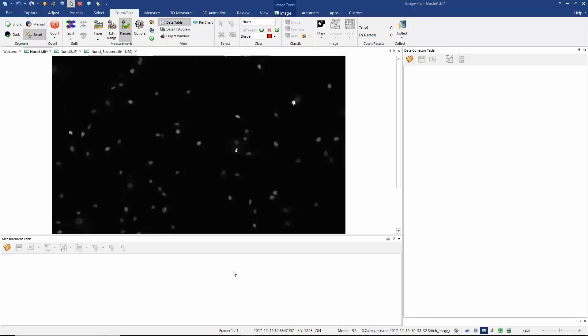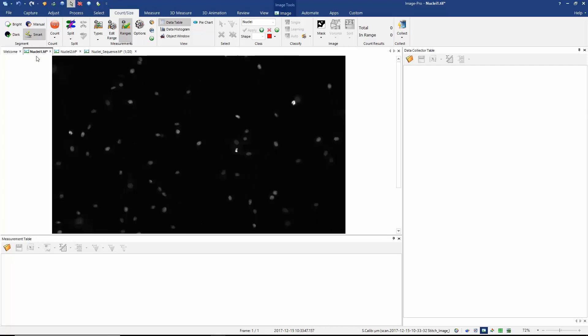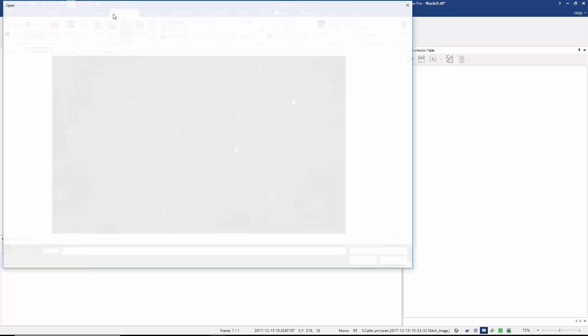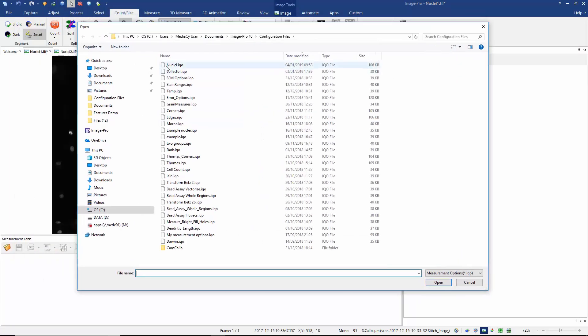So first off let's review how we use the data collector. I'm going to start off by just measuring two images in which we only have one frame. The first thing I'm going to do is restore my measurements options here. You can see I'm using the count size tab.